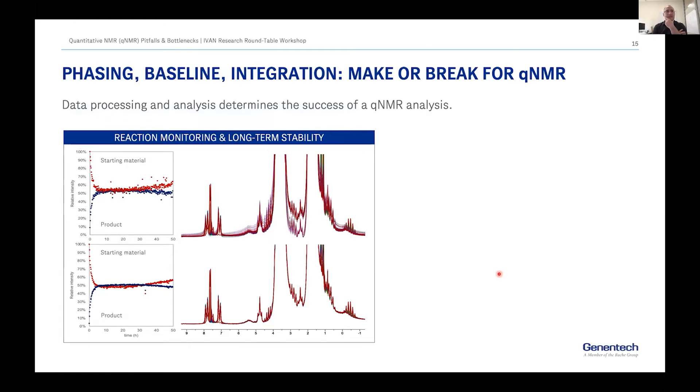What I think can really make or break qNMR analysis is how you phase and baseline-correct your data. I'm sure all of you have seen examples where you try to make a single peak as symmetrical as possible and make the baseline as flat as you can. I'm sure Gennady is going to have a lot more to say on that front. What you see on the screen is a reaction monitoring and long-term stability study — 300 spectra collected over 50 hours — and there is absolutely no point in trying to do any manual phasing or baseline correction on these datasets.